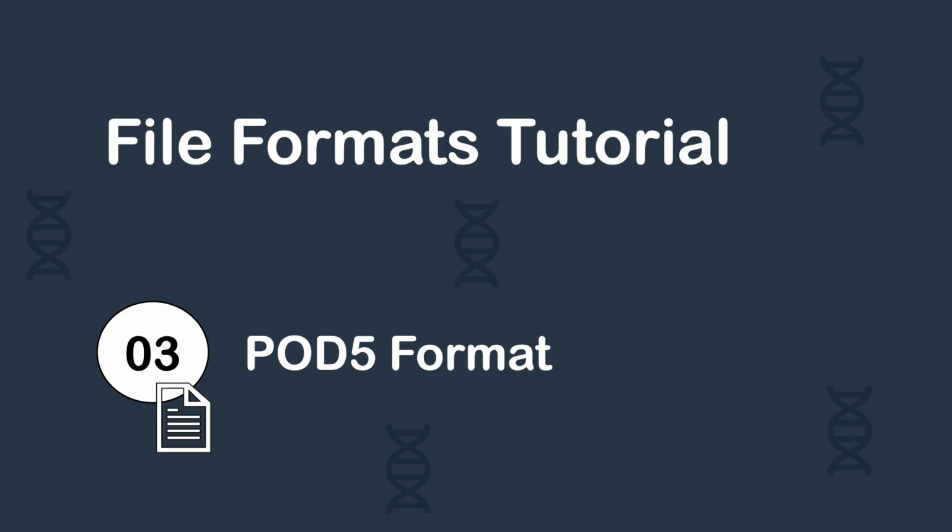Now, POD5 files are probably one of my favorite file types to work with because they have some interesting properties that can make working with this data a challenge. Let's get started.